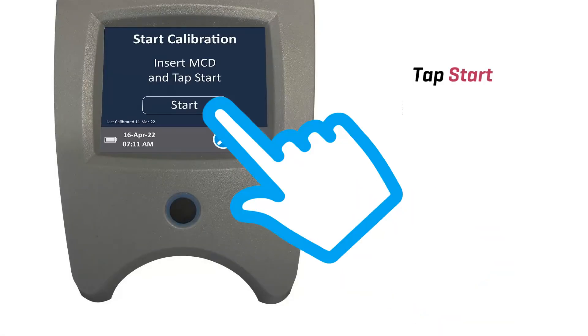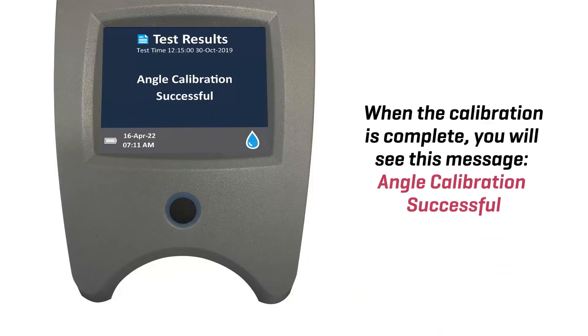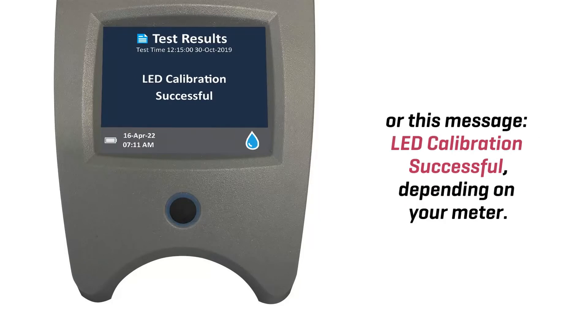Tap start. When the calibration is complete, you will see this message: Angle Calibration Successful, or this message: LED Calibration Successful, depending on your meter.